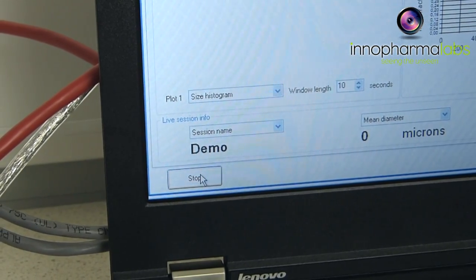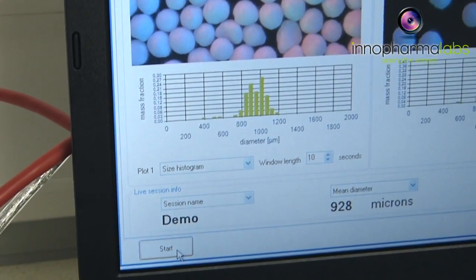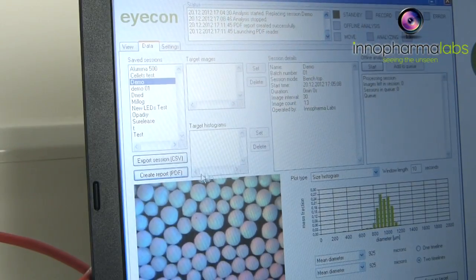When the analysis is completed, the process is stopped and a mass fraction histogram of the measured particles is generated.